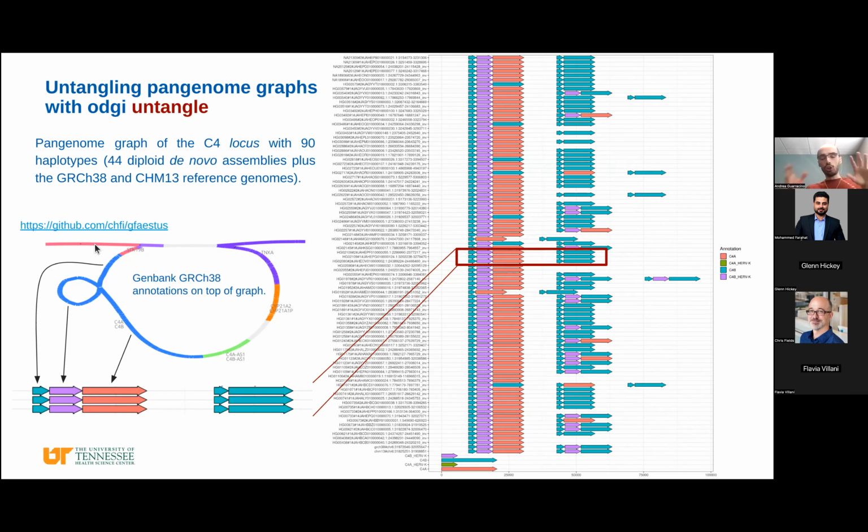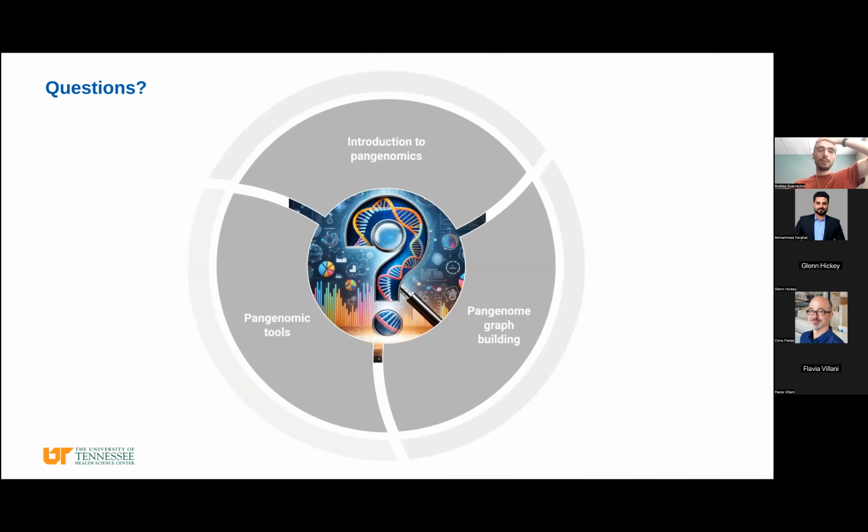We will generate all these steps, graph extraction and graph untangling, for this locus also during the workshop. So those are a few examples of how we can visualize and practically work with pangenome graphs. And that's it from my side. Any questions?